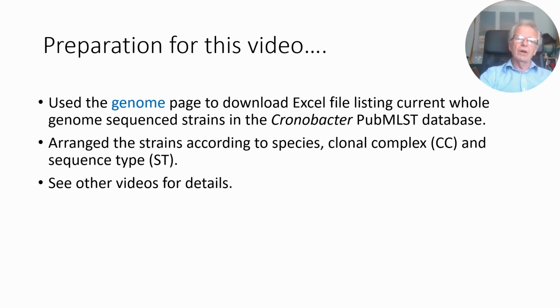Now, in order to prepare for this video, for the examples I'm going to show you, I went to the genome page. I generated an Excel file of the complete database. Now, this is open access. Anybody can do this. So the whole database you can export as an Excel file. I then arranged the Excel file according to species, clonal complex, and sequence type.